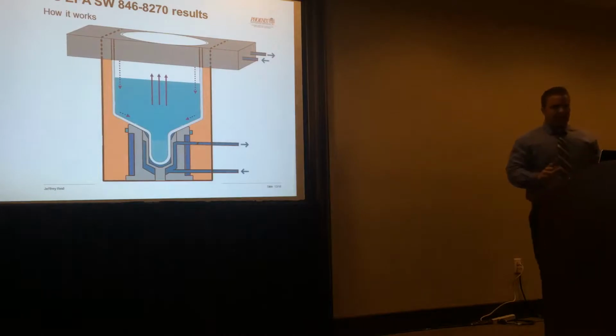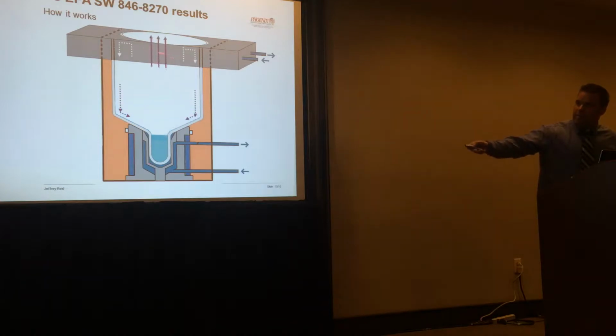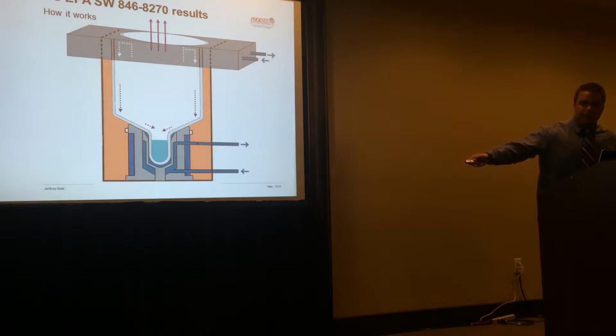So here's a schematic of how it actually works. You can see the Flushback Module is this here. There's a coolant going inside, a coolant going out. You have your solvent level up here, and this is where you're going to capture your 1 ml or whatever your residual volume is in your laboratory. You'll capture it here. So the evaporation process starts, it hits this chilled zone, and it'll actually come back down and rinse back down to the appendage.